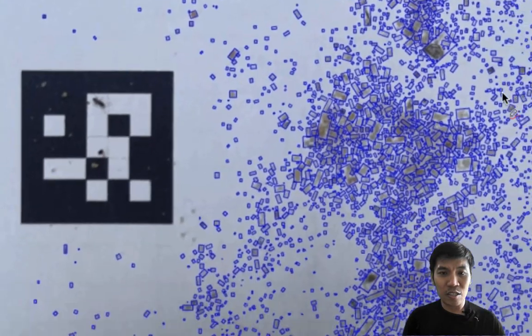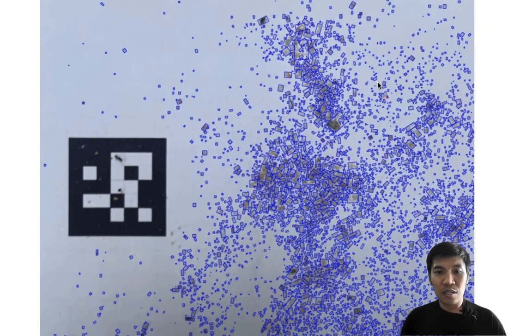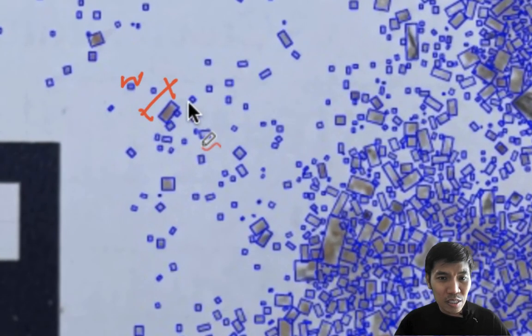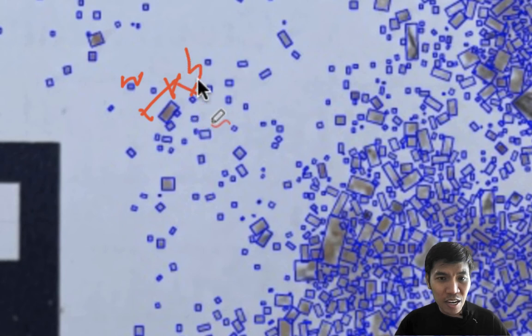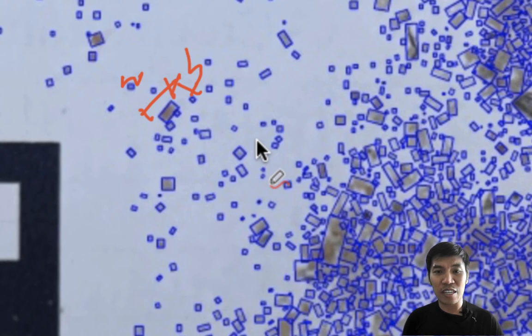the computer will detect the soil particles into rectangles. We see they have a width and height. If we get the average of the width and height, we can know the particle size.